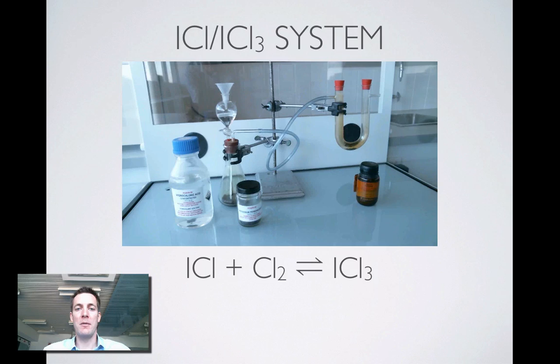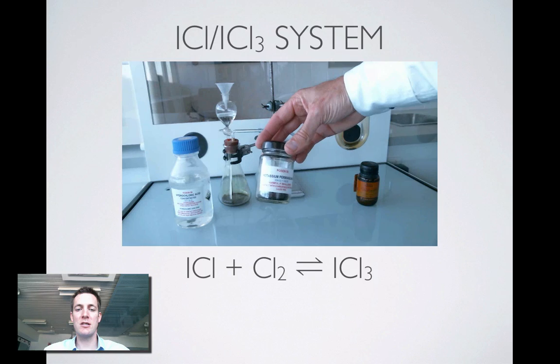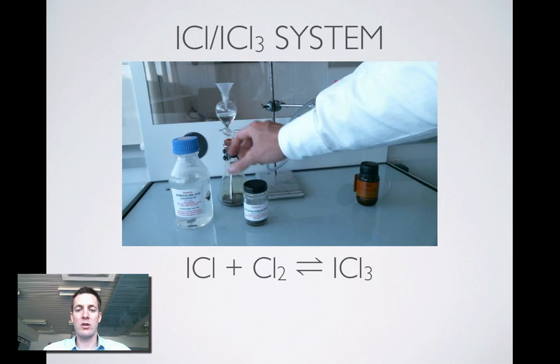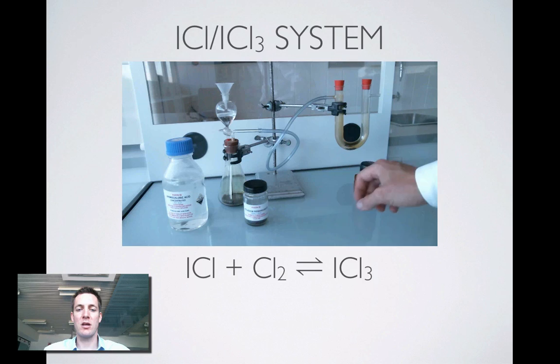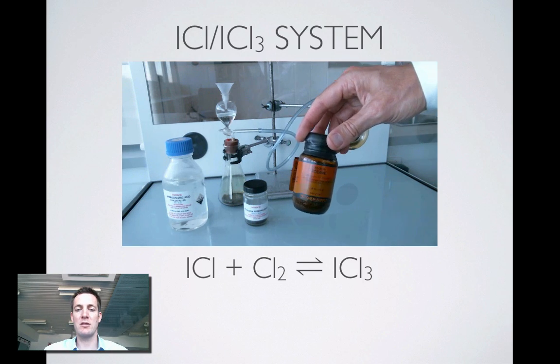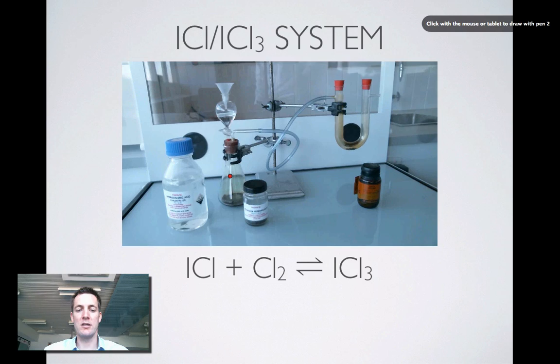We're going to start off with one which I quite like actually. It's the ICL, so iodine monochloride and ICL3 system. I'm just showing you the chemicals that we're using here to make the chlorine in this left hand flask. So the chlorine is going to come from the left hand side. It's going to react with iodine on the right hand side to produce ICL.